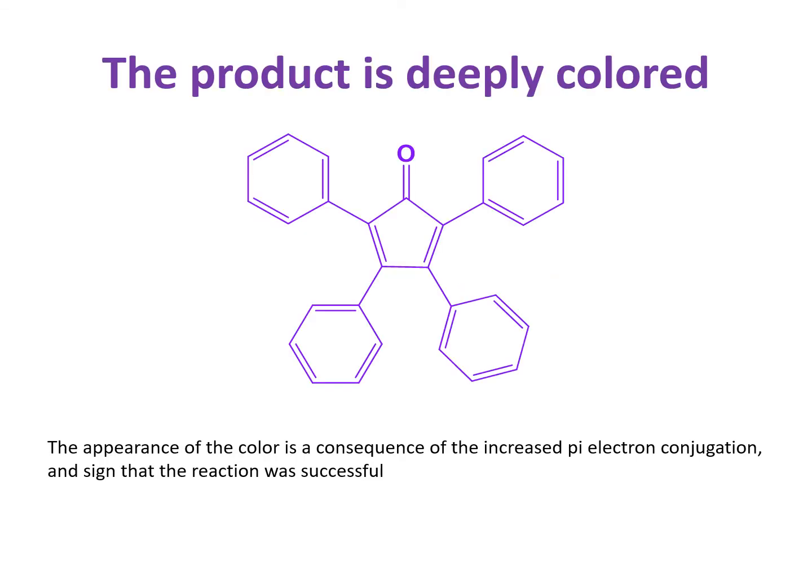This product is deeply purple. The appearance of the color is a consequence of the increase of the pi electron conjugation and a sign that the reaction was successful.